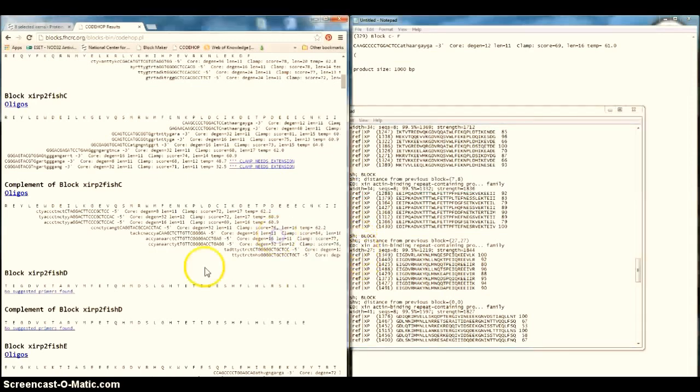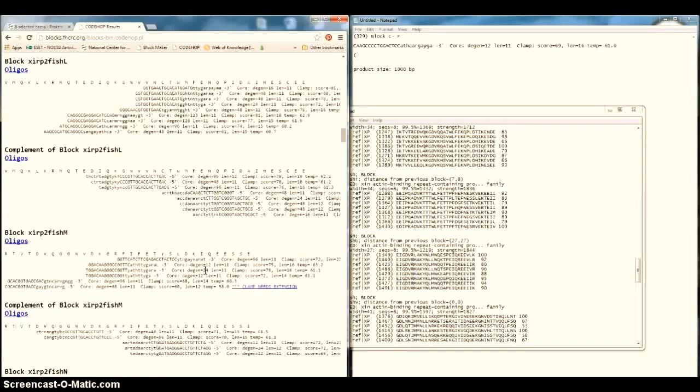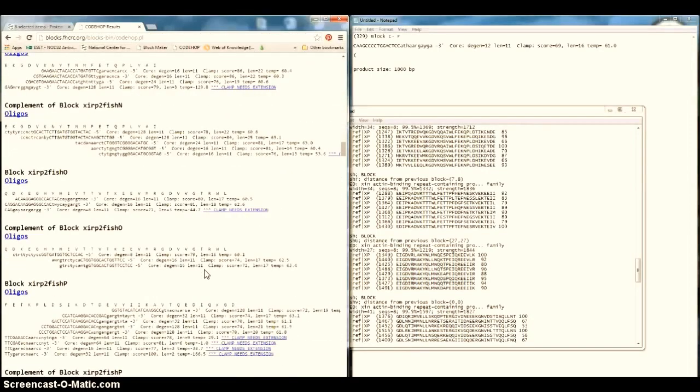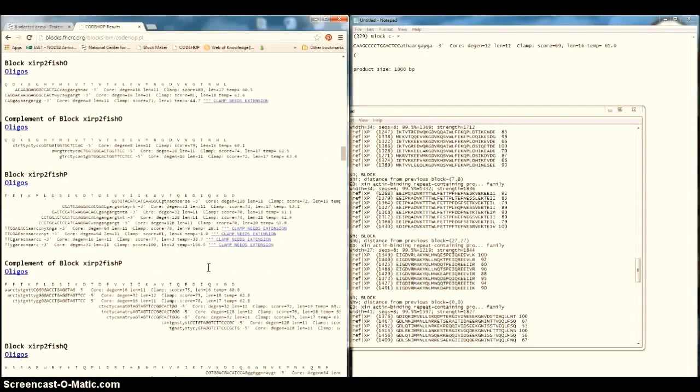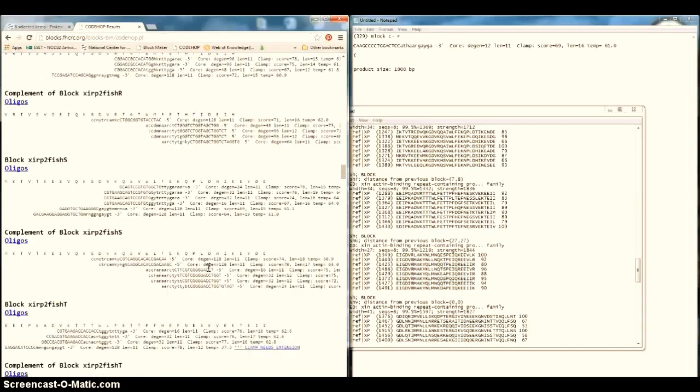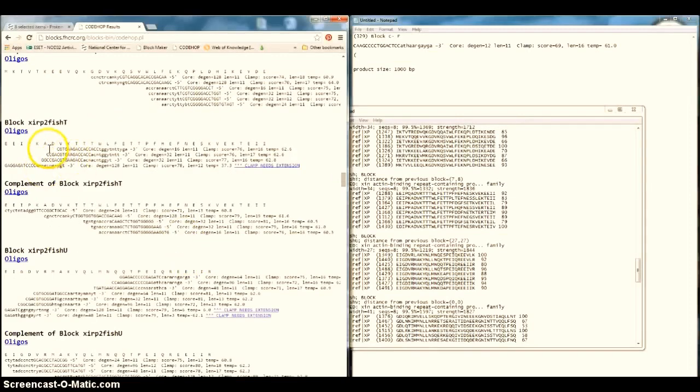So let's check if there are any suggested primers for us. So I'm checking now. Let's go T. Yes, T. Oh, good. We are lucky, and here are some primers which are recommended for this fragment of protein.